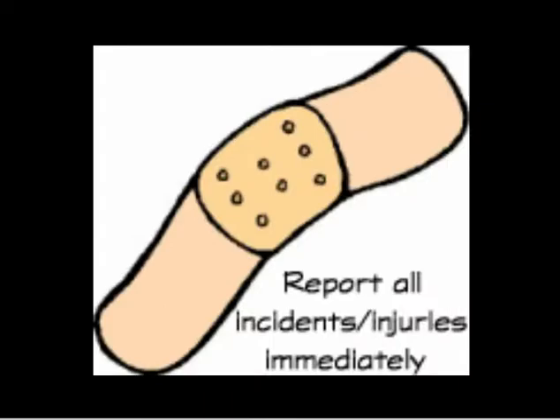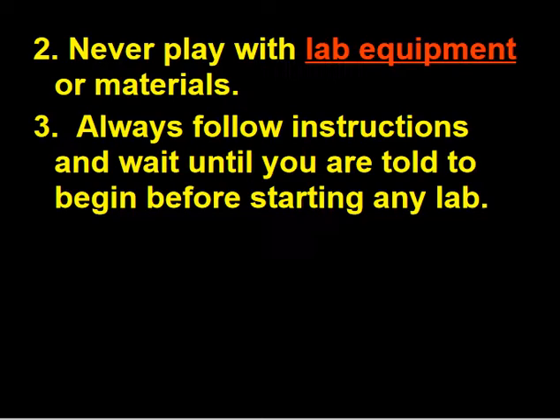If you do get injured, report it to me. If you think it's worthy of reporting, report it to me. So I'm not talking about every paper cut, but if you cut yourself on glass, if you get a burn, let me know. Because a lot of times I'll hear back from parents a day or two later. It's like, oh, what happened in class? Or the principal will come and ask me because your parents called the school. They'll say, well, what happened in class? I won't have a clue as to what happened if you don't report it.